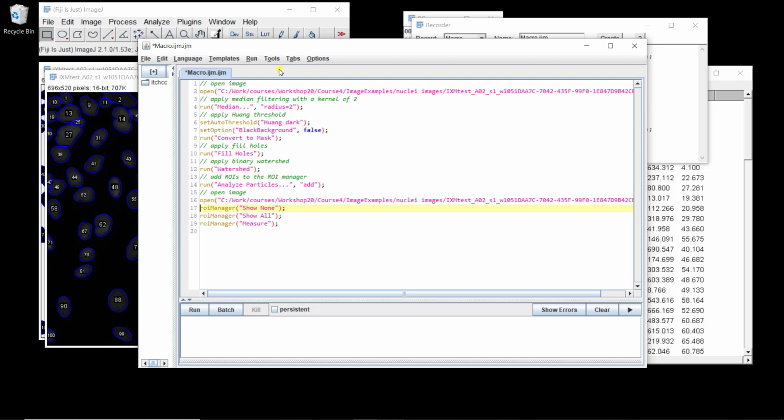And then here you see there's show none, show all. It's because I had to uncheck because it was already checked, and then check show all. That actually I can just get rid of this and then show row overlaid on the image, and finally extract features. Alright, so now I can apply this macro and see what we get.